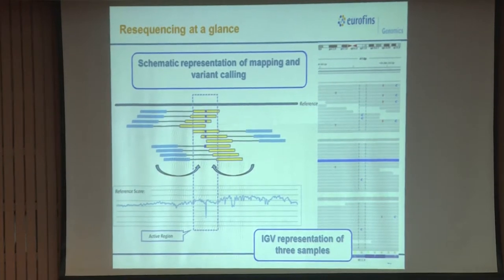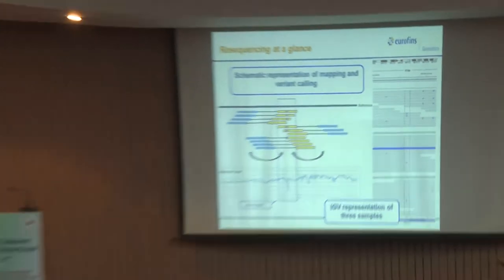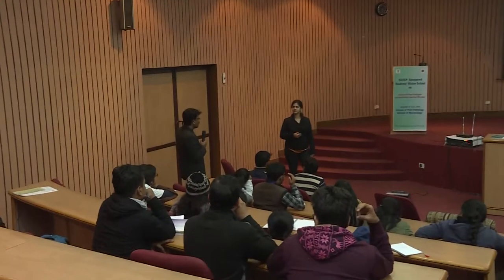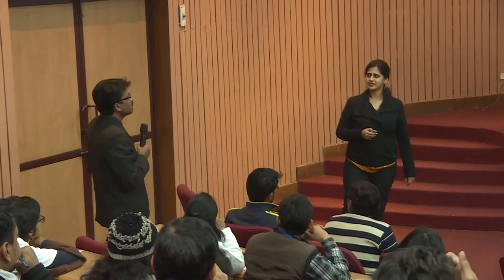I have a small question. Yeah. Can you do resequence? The costs are considerably less as compared to de novo assembly. Yes. Right. When you do this resequencing, which sequencing platform is ideally suited?